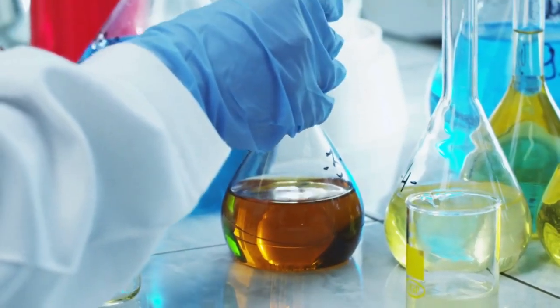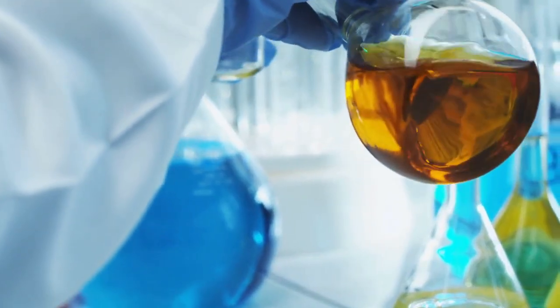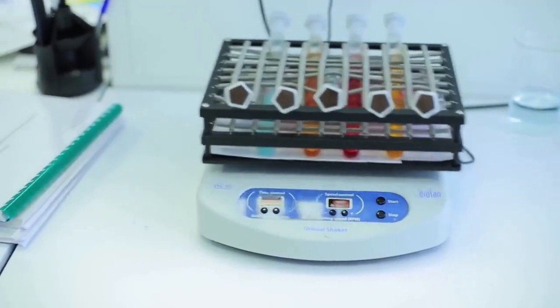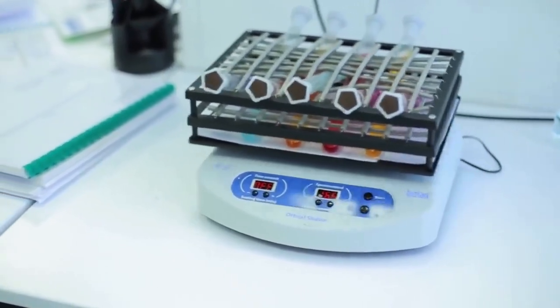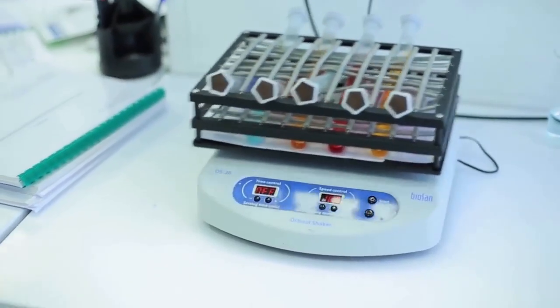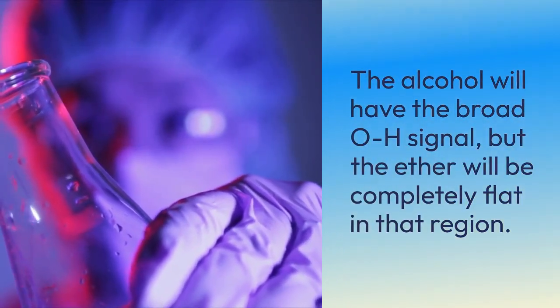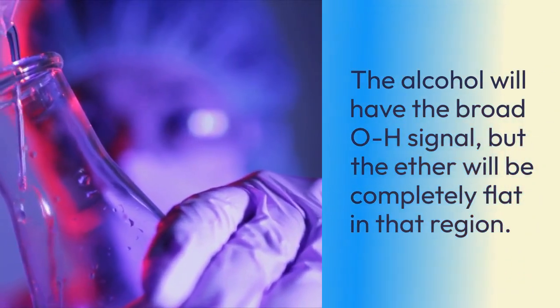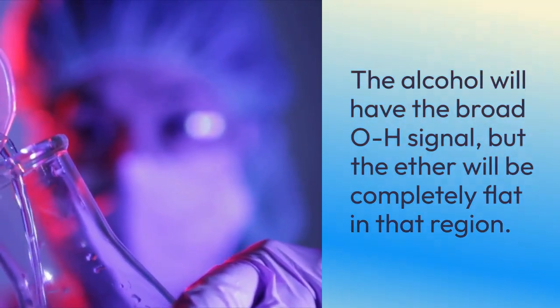Second, let's talk about the hydroxyl group, the OH bond. This peak is the complete opposite of the carbonyl peak. It is very broad and rounded, often looking like a big, wide U-shape. In an alcohol, this broad peak appears around 3200 to 3600 wave numbers. If you need to distinguish an alcohol from an ether, which both contain oxygen, you look for this broad OH signal. The alcohol will have it, but the ether will be completely flat in that region.